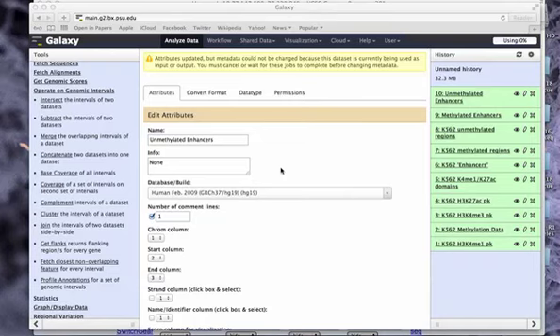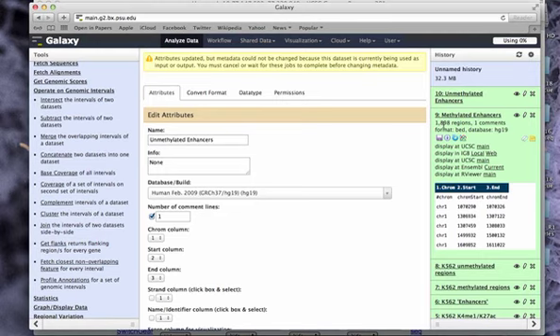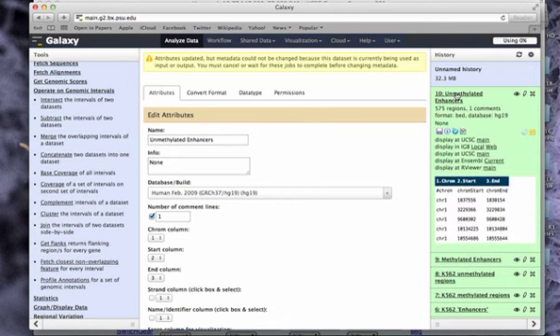Okay, with that analysis done, now we have our data back. So of the enhancers that we looked at that have CpG data available that was measured by this assay, we have a little under 1900 regions that are significantly methylated, and we have a little under 600 that are unmethylated. So this is about a 23% unmethylation rate in enhancers, and I'm interested in those.